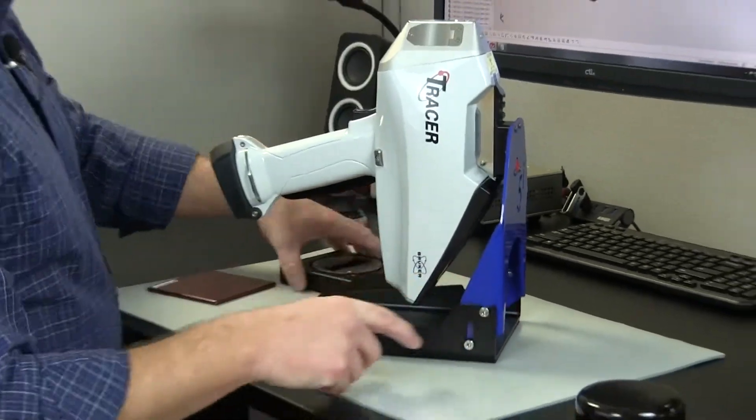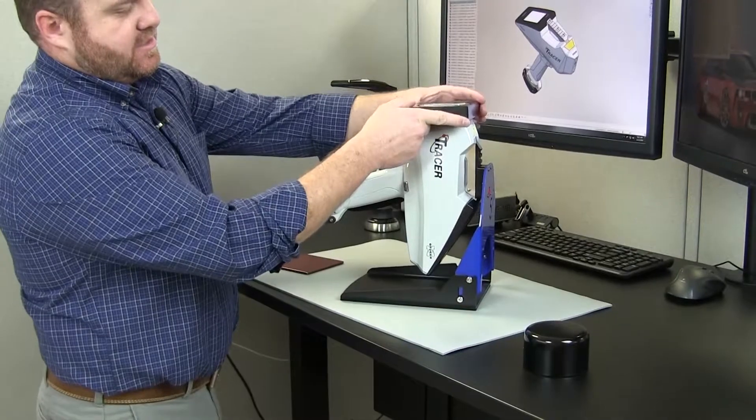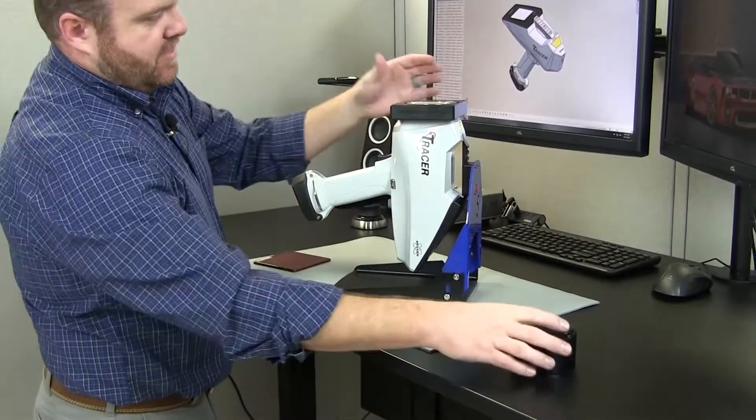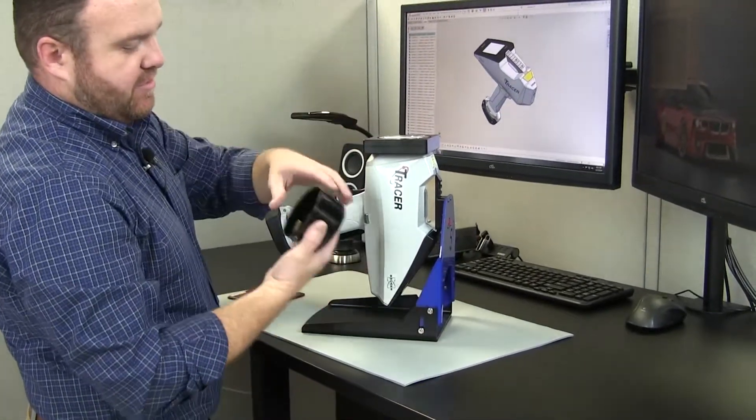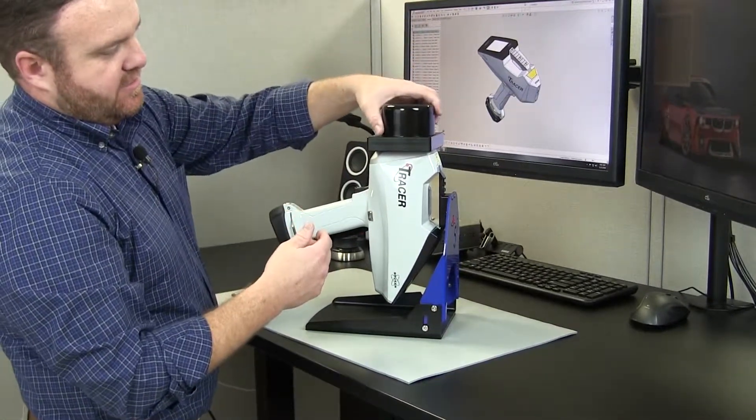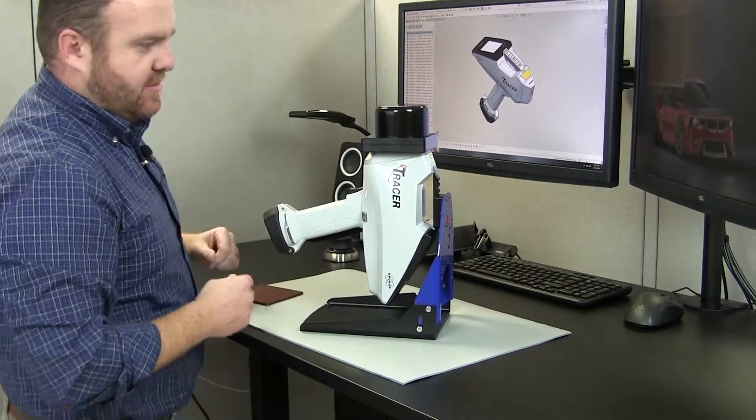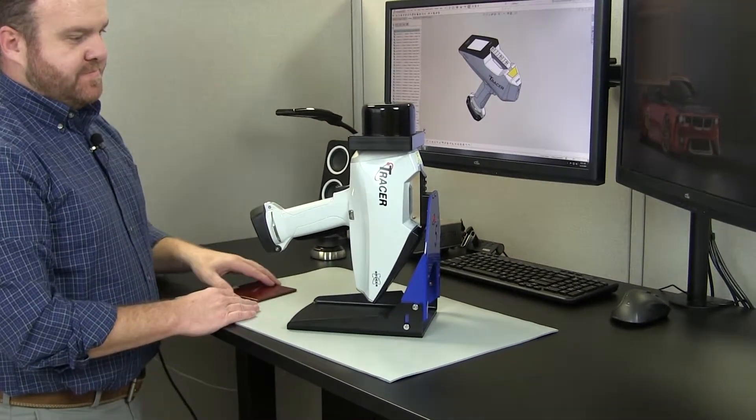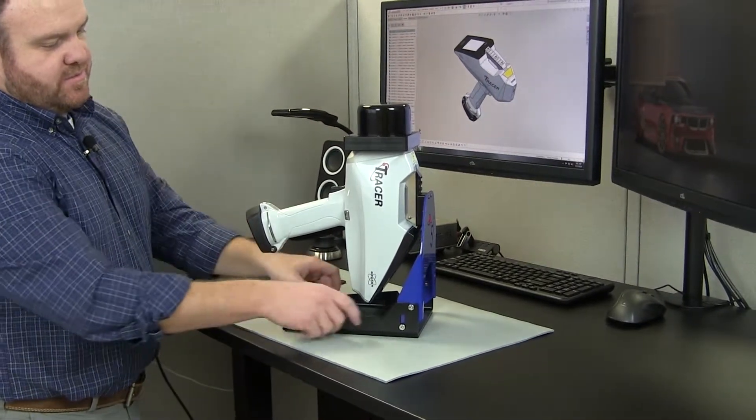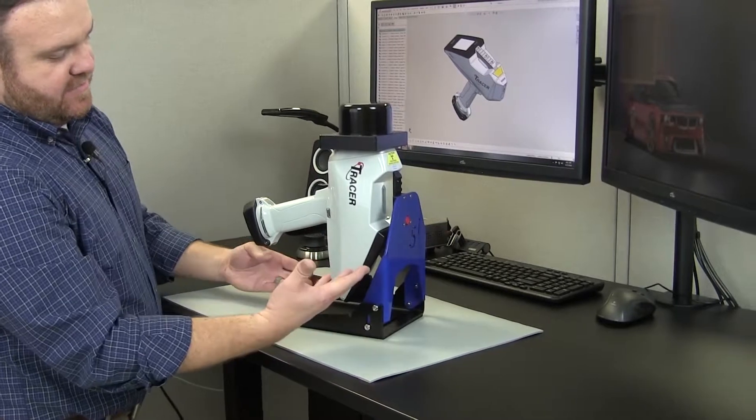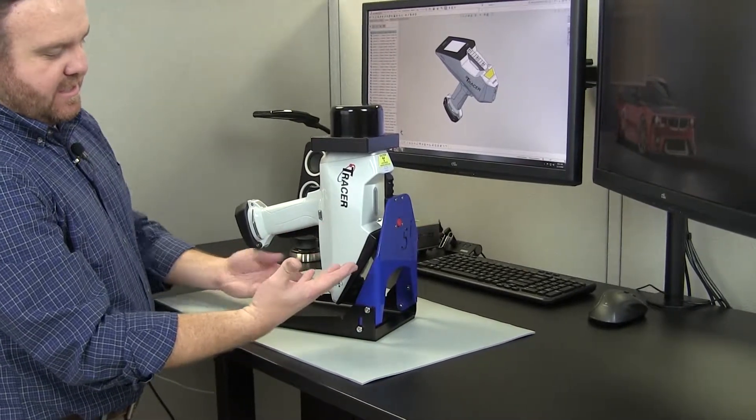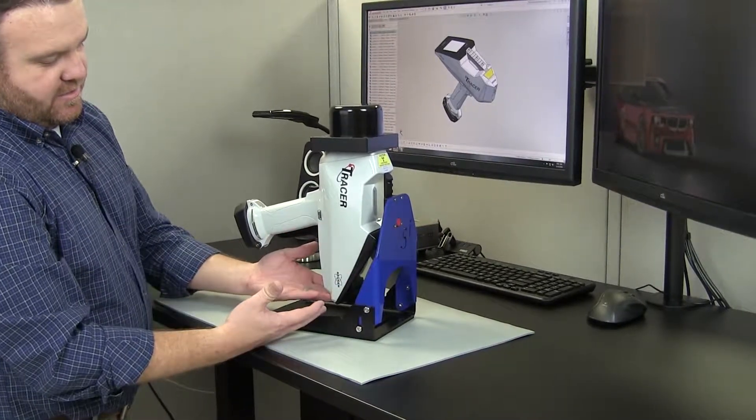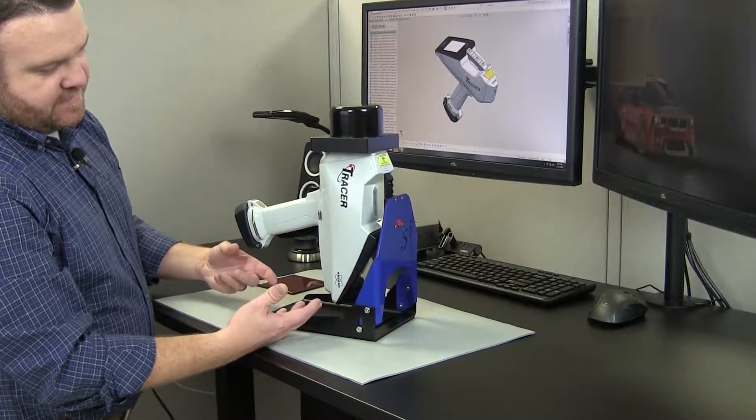There's a sample stage that goes on top and then you can place your sample there and your cover to cover the top of it. That's ease of access for the nose up, very simple. Your cables are routed through the bottom.